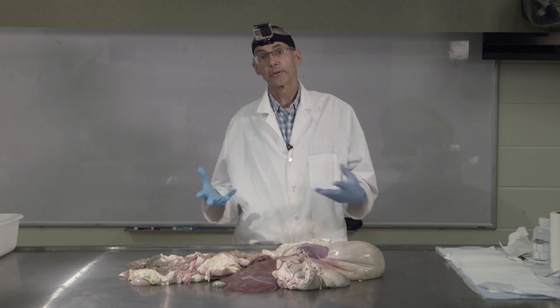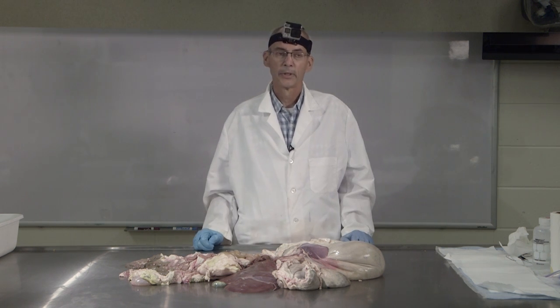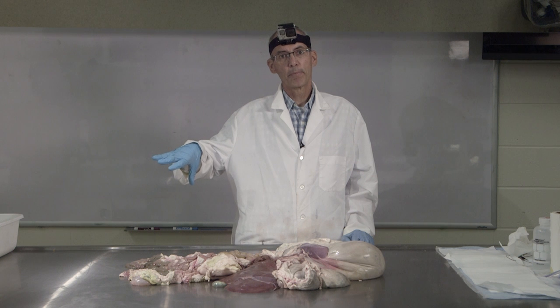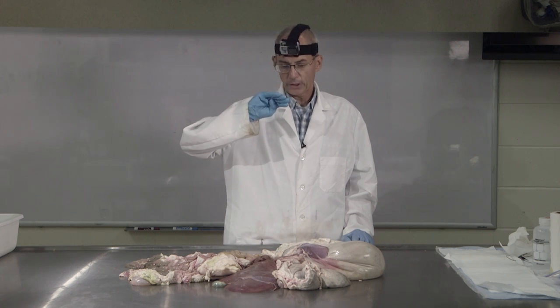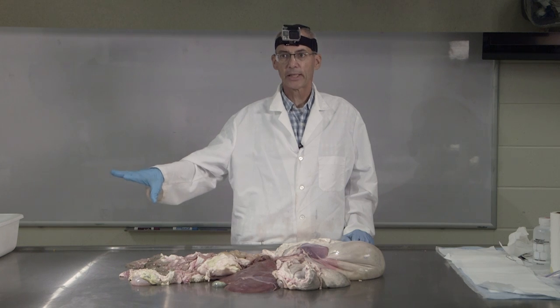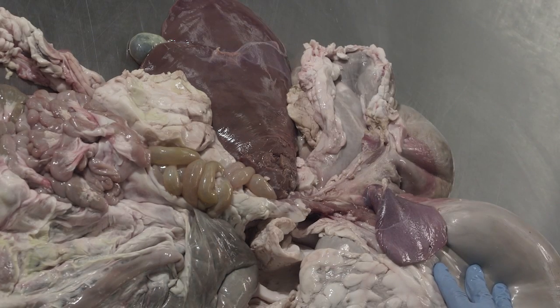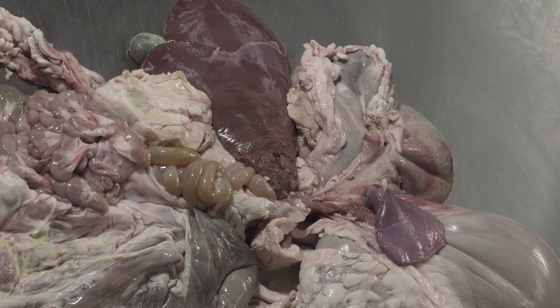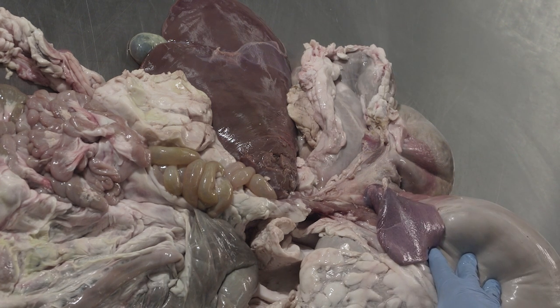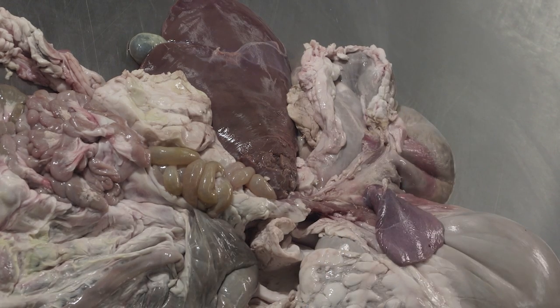So in a sense, you can think of this digestive tract as being just the opposite of the pig's. Microbial digestion in the pig occurred last, at the very far end of the digestive tract, whereas in a ruminant animal, it occurs right at the beginning, up front. All food material is going to be subject to microbial digestion first in these 2 compartments.